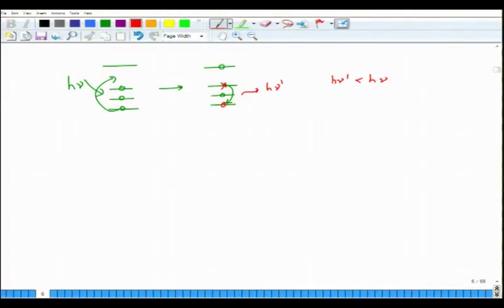But what it has done is, if secondary X-rays come out of the material, this leads to a phenomenon which is called X-ray fluorescence. This fluorescence creates a lot of noise in the system, because many photons come out, go to the detector, and get detected, and as a result they create a lot of background in the system.